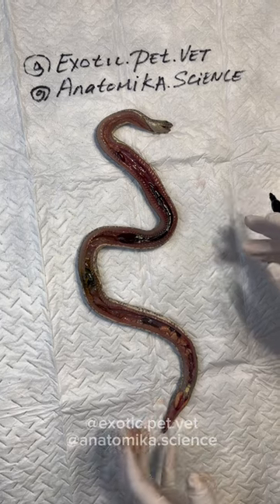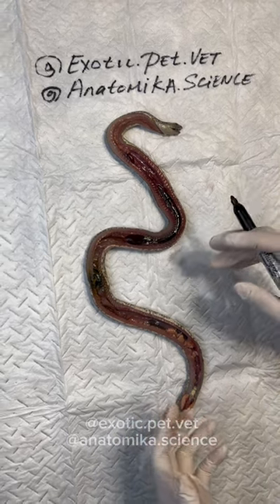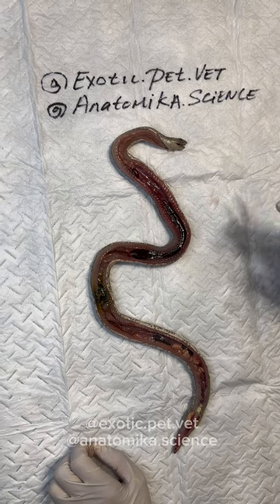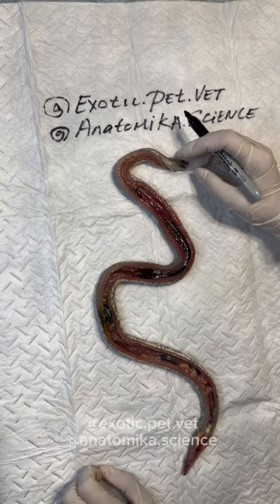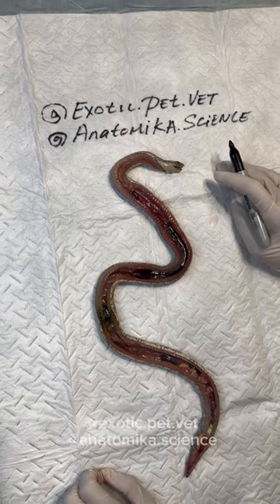In a case like this, we would have to send tissues to the lab because there's nothing — no big tumors, nothing huge. So it may be a histopathology thing to determine what she really died of. But she is fairly nice looking inside, and this is a great chance to take a look at snake anatomy in general.